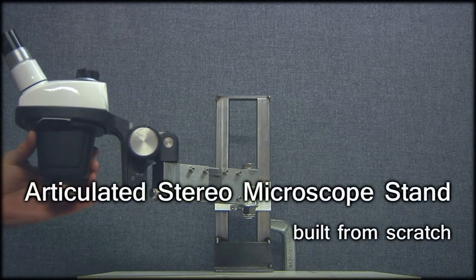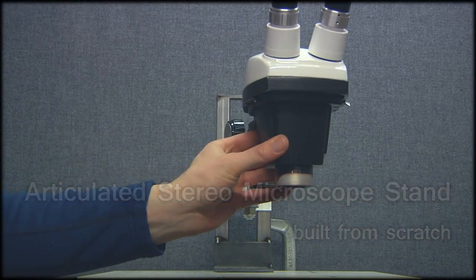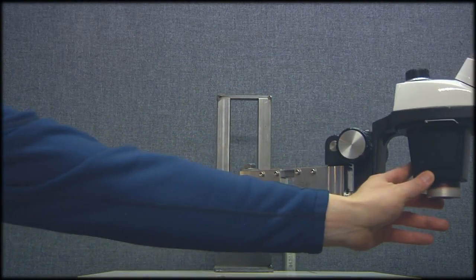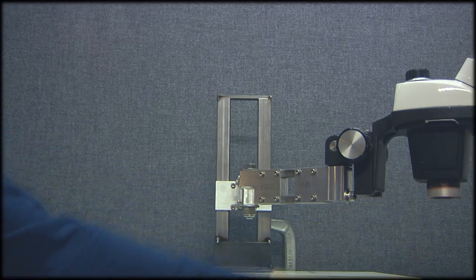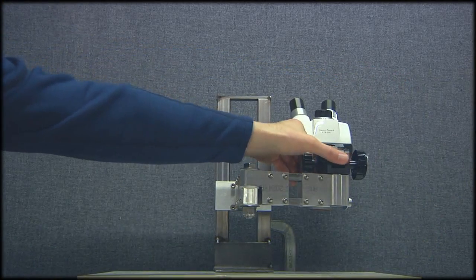Well, it's not necessarily hard, but it certainly was time consuming, but I am really happy with the end result. It's a lot more flexible than some of the ones you can buy off the shelf, it allows me to tuck the microscope away when I'm not using it, and it was kind of a fun project.